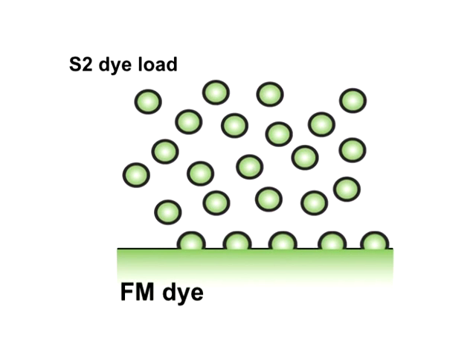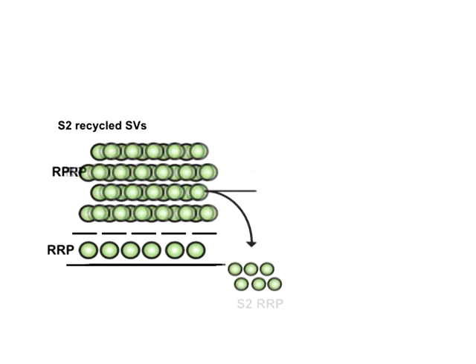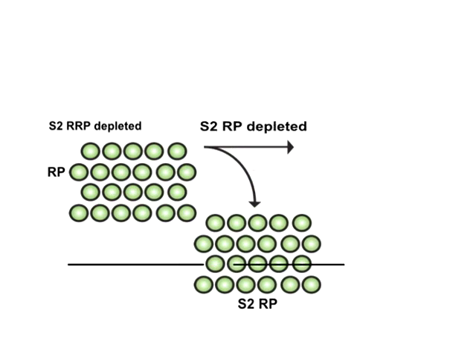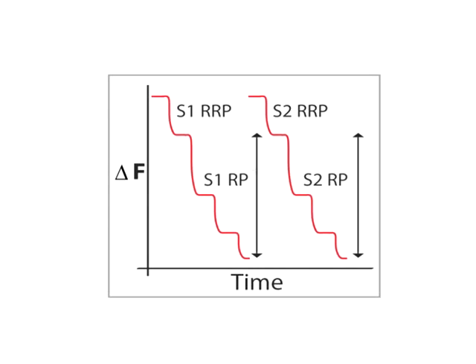Next, change either loading or unloading conditions in order to study the effect of the chosen variation on either synaptic vesicle pool replenishment or mobilization. Results show that FM dye loading of different synaptic vesicle pools is reproducible based on the quantification and analysis of the evoked dye unloading.